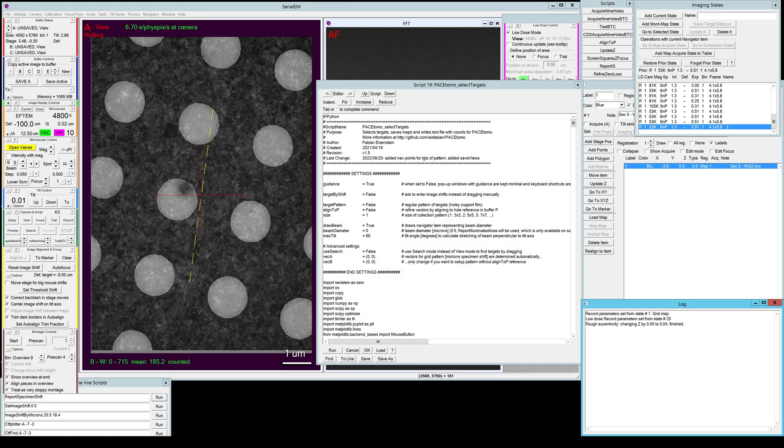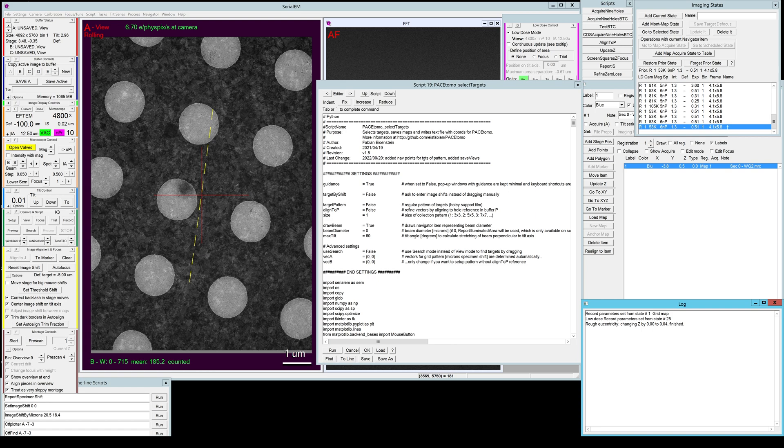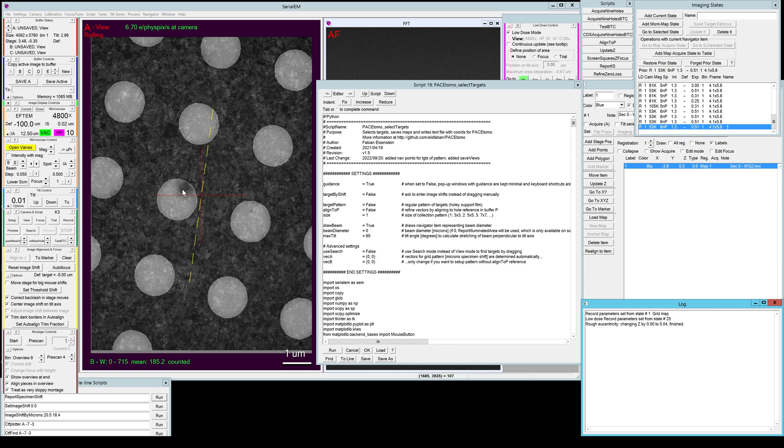Hey everyone, this is another video tutorial for parallel cryo-electron tomography or Pace Tomo. In this video I want to show you how to set up targets on a holy support film. For that purpose I floated a purified ribosome grid on ultra ufoil and here we see one of the squares.